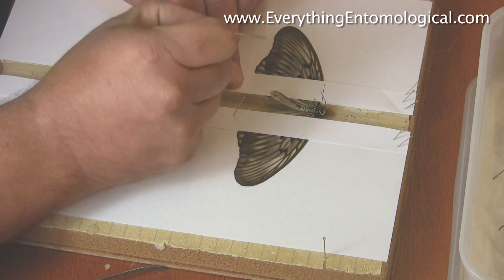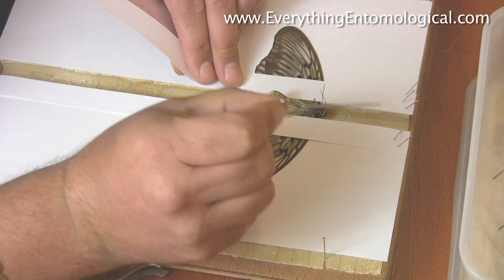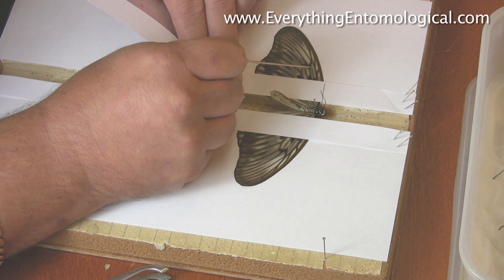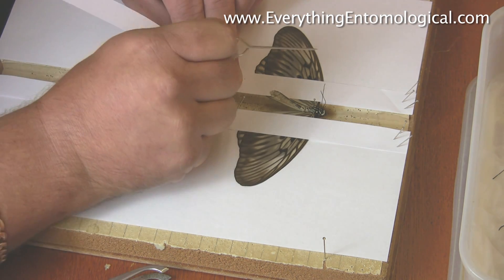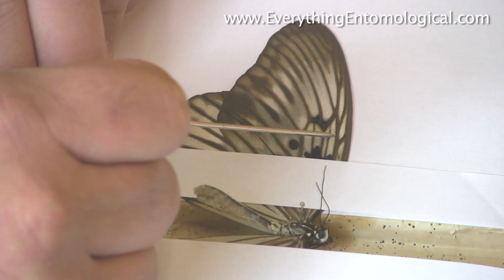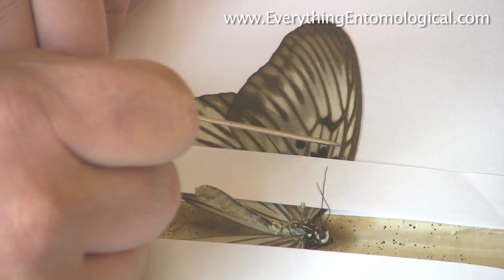You don't want to jab holes in the wings — you don't put any pins through the wings. Get your needle, setting needle, or large pin however you prefer, and find the thick veins. You've got veins all over the wings — use the strongest ones to push. You're not jabbing; you're resting and pushing. So I'll do this side first — as I'm pushing, I'm lifting it up so it can move.